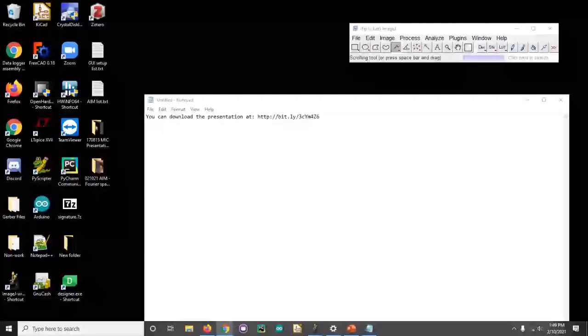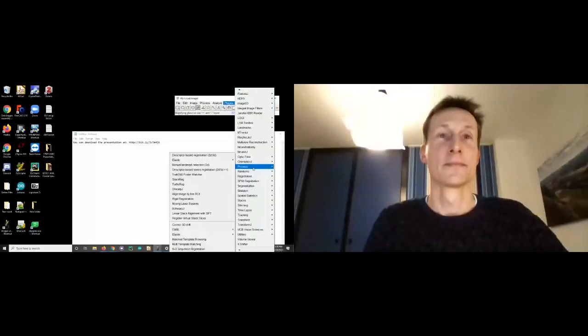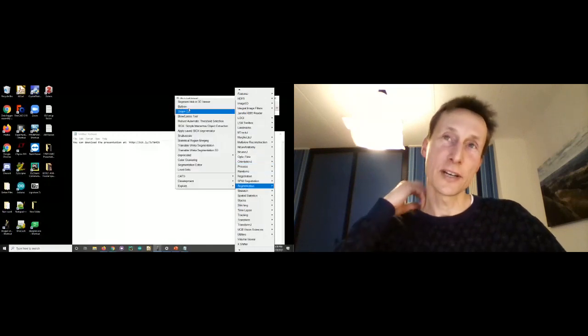Oh, now top hat makes sense. Yeah. All right, Bram, you should be able to, if you click join the video and audio. Because I think that top hat might be part of the trainable Weka feature space, if I remember correctly. Hi. There's also, because I know the sombrero, which is the difference of Gaussians. Yeah, it's more or less like that.